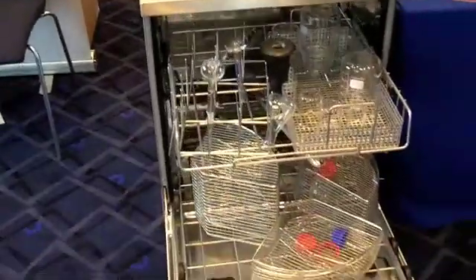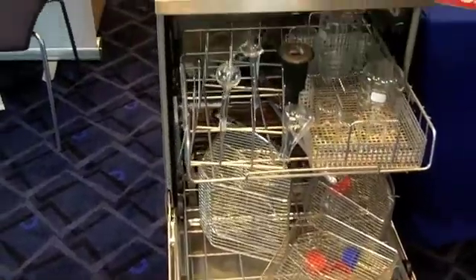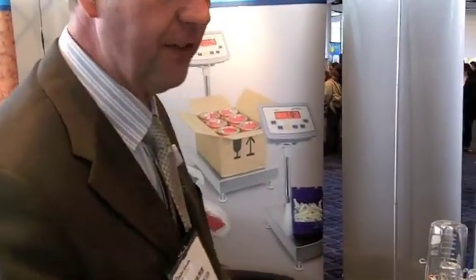Today at Fisher Science World we're demonstrating the G7883 laboratory glass washer. It's a washer disinfector, so in other words it will reach temperatures above 90 degrees for thermal disinfection.